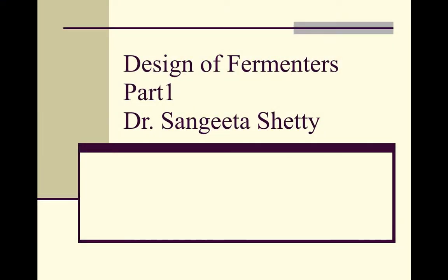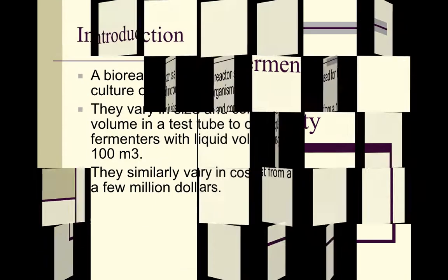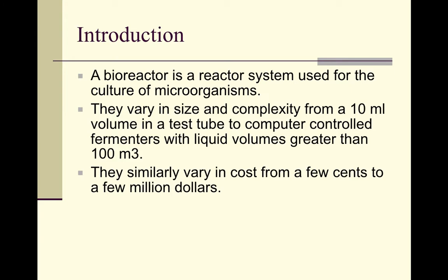Hello friends, today we are going to learn about the design of fermenters. We'll be doing this in two parts. The first part of the video deals with fermenters which are used to grow the aerobic organisms. Now fermenters are synonymous with this word bioreactor.